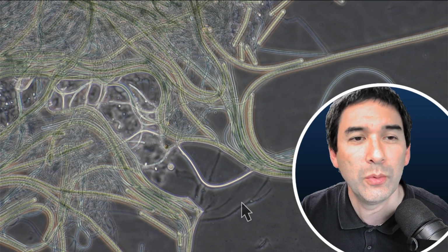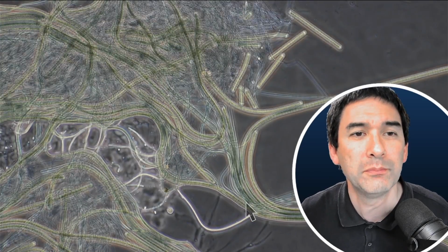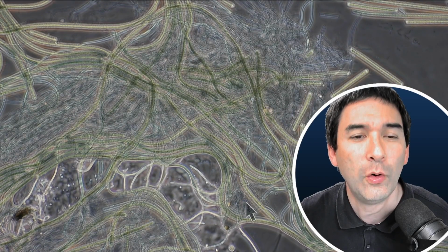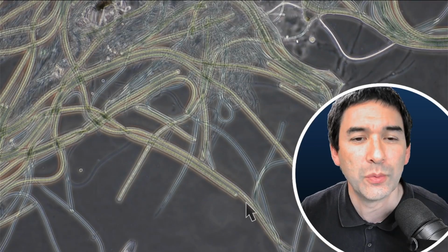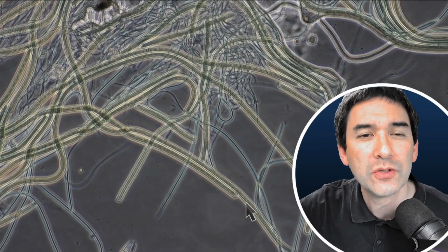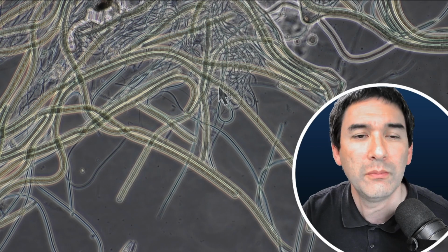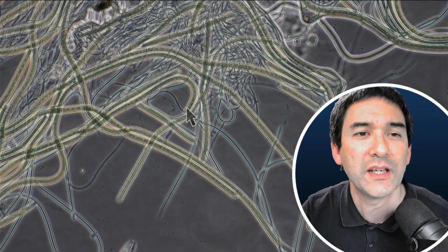Yeah, so actually what we probably have here is not only a mixture, I bumped my slide now. Apparently what we have here is not only cyanobacteria, but probably also a whole bunch of fungal hyphae as well. And that's also one of the reasons, because fungi do not do photosynthesis and they're not green. And so it could actually be that those other filaments here are probably either fungi or maybe also other bacteria. Okay, I don't know. But probably not cyanobacteria.